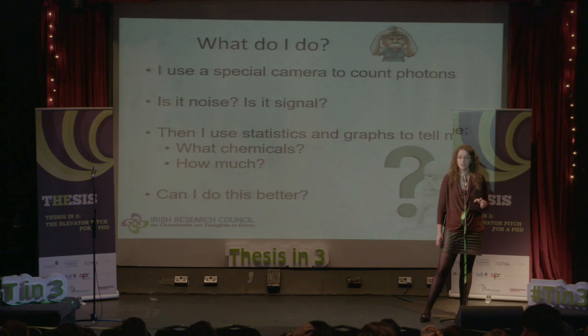So once I've done that, I reanalyze the entire process that's used to produce this data, and I want to see if I can do it in a more efficient manner. So that can be done by optimizing the hardware used to produce and collect the photons, or optimizing the statistical algorithms used to classify the data and to examine it. So greater efficiency will mean greater sensitivity to smaller amounts of chemicals.